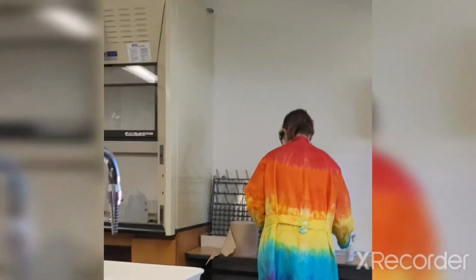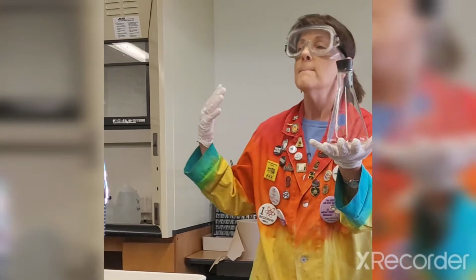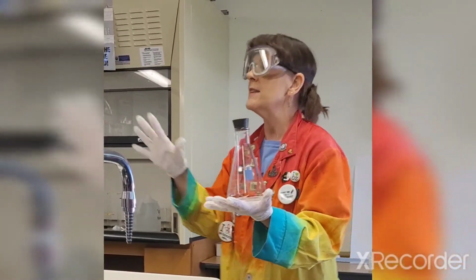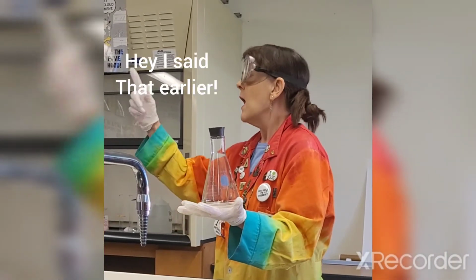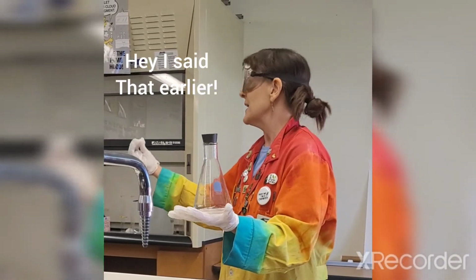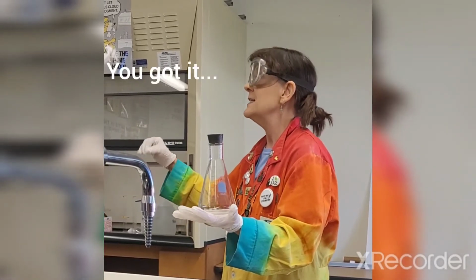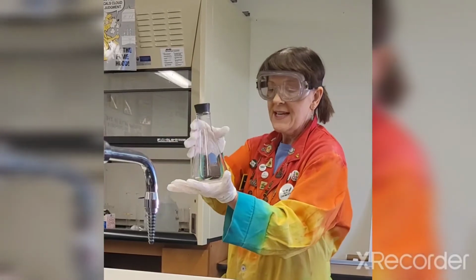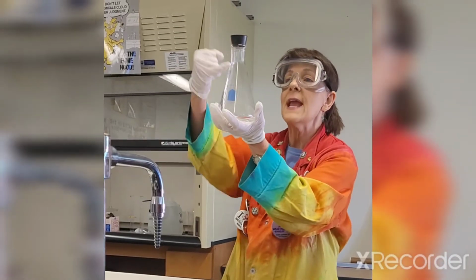Talk a little bit about our organic chemical. So hexanes. Mainly carbons and hydrogens, just like gasoline. In fact, hexane, the formula is C6H14, and gasoline is mainly octane, and that's C8H18. So it's just carbons and hydrogens, but they tend to evaporate a lot. And when they do, you can't tell.